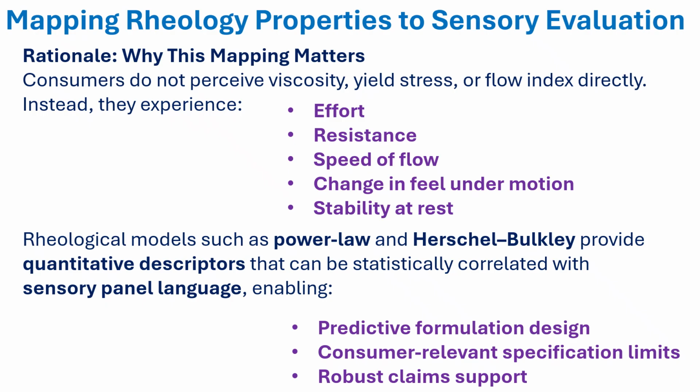However, consumers do not think or talk in rheological terms. They do not perceive viscosity, yield stress, flow index directly. Instead, they describe such sensations as how much effort it takes to scoop the cream, how much resistance they feel when spreading it, how quickly it flows, how the feel changes when they rub it in, and whether the product feels stable when left to rest.